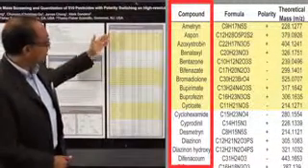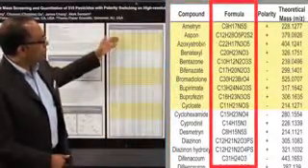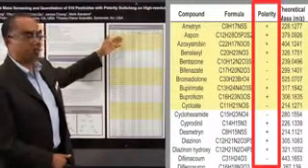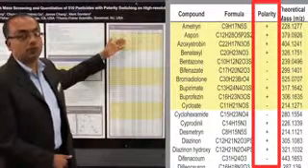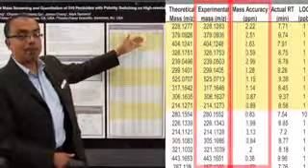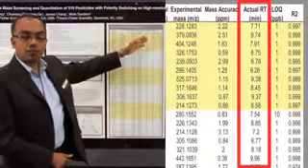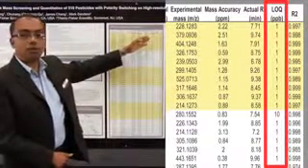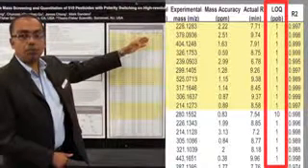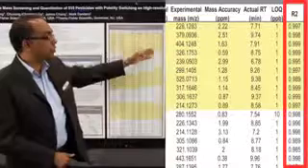On the left here we have the list of the compounds in alphabetical order from ametryn down to warfarin. The elemental formula is given here as well as the polarity of the instrument which is being used to detect or ionize these compounds, either in positive or negative electrospray. The theoretical mass is given, followed by the experimental mass and the mass accuracy in parts per million. So we have given the retention time for each of these compounds. In addition, the LOQ, the limit of quantitation for each of these, is given, which ranges around the 1 ppb, part per billion mark, as well as the quant statistics. Only the R-squared values are shown here.